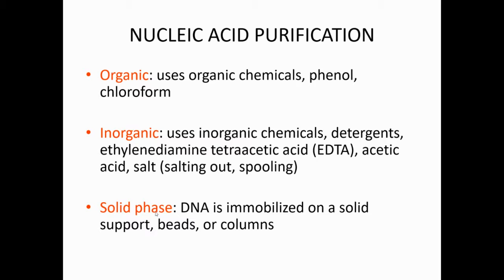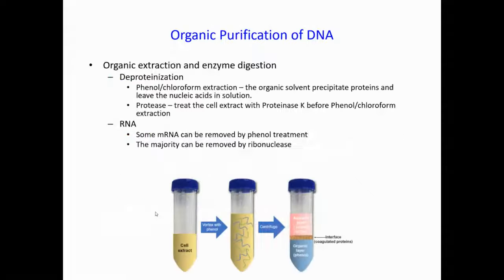Or you can use the solid phase, like beads and columns, to isolate the DNA. For the first one, the organic purification, normally we use a phenol-chloroform extraction. That's commonly used to purify the DNA.